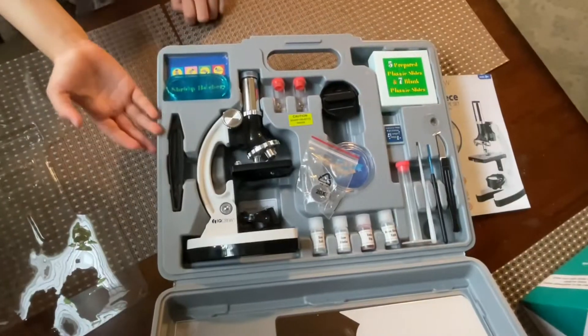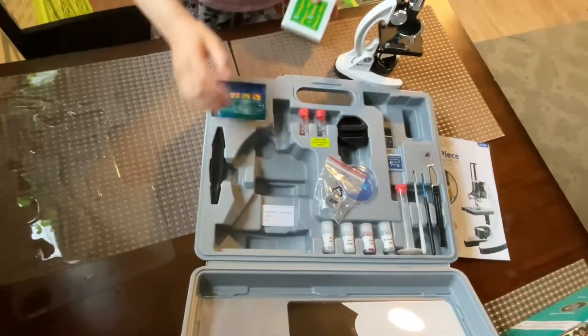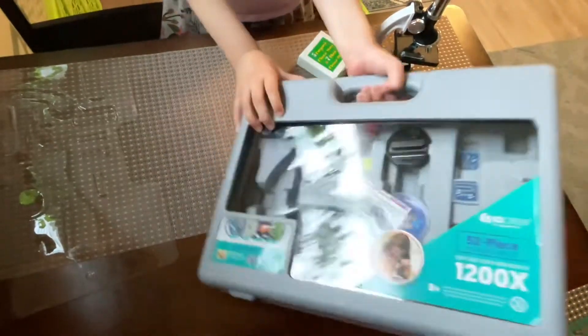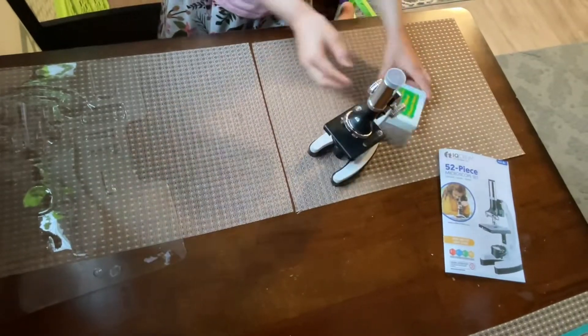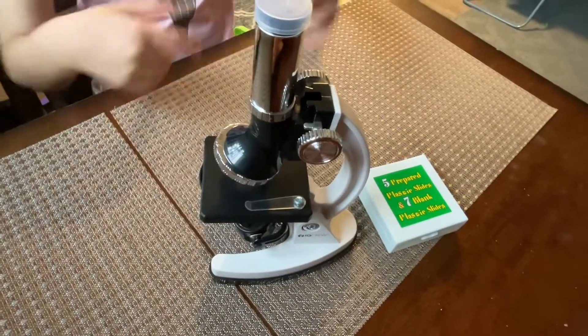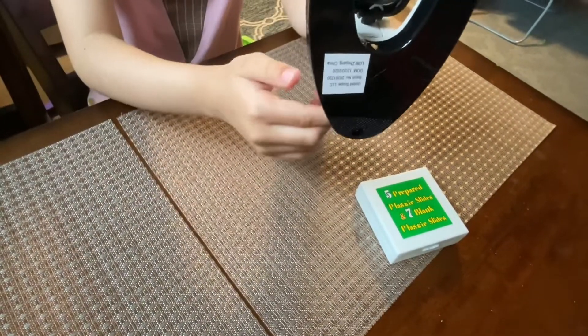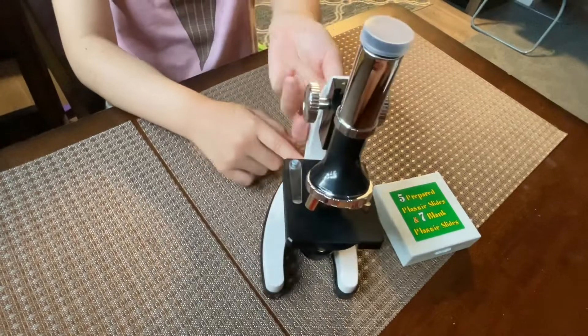I'm going to show you how to use the microscope. First you have to put the batteries in. Here's where you put the two batteries in. Make sure to ask a grown-up to help you put the batteries in.